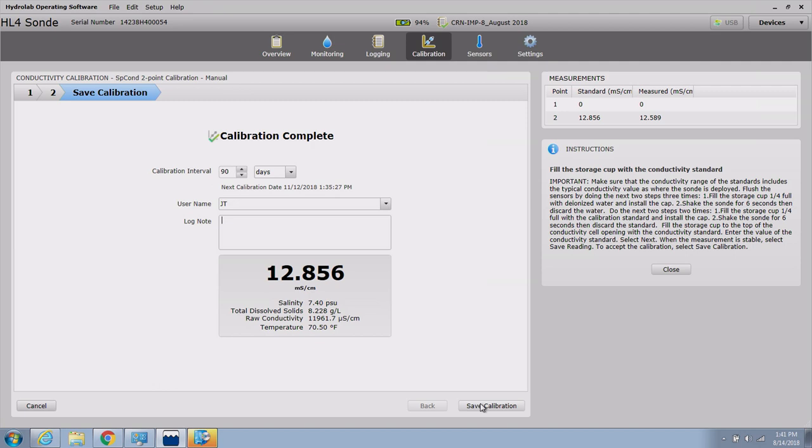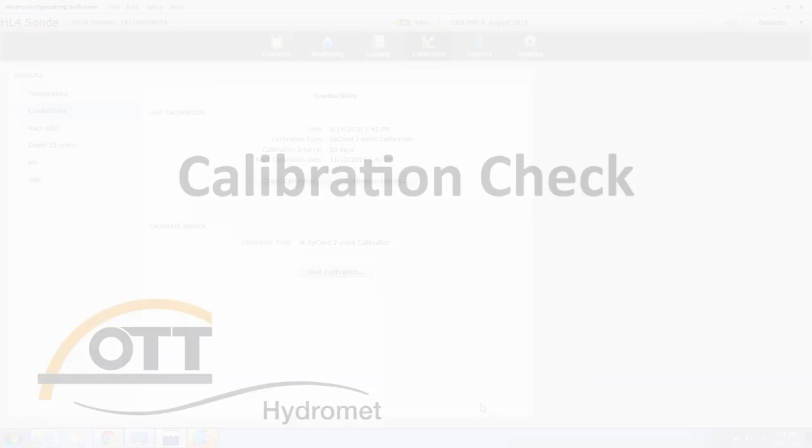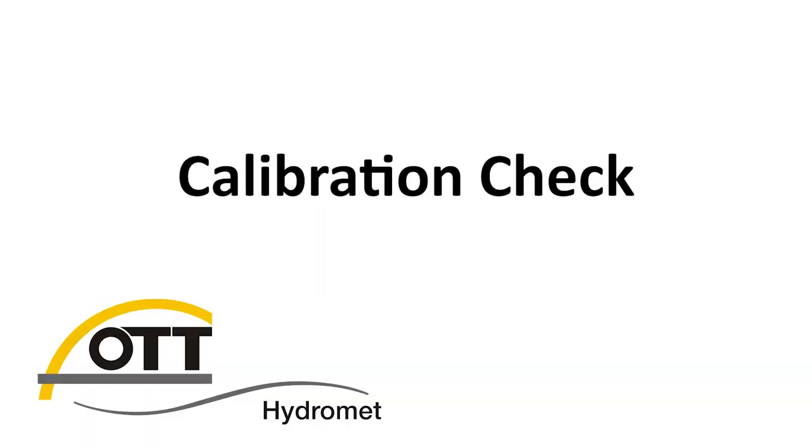To accept the calibration, select Save Calibration.